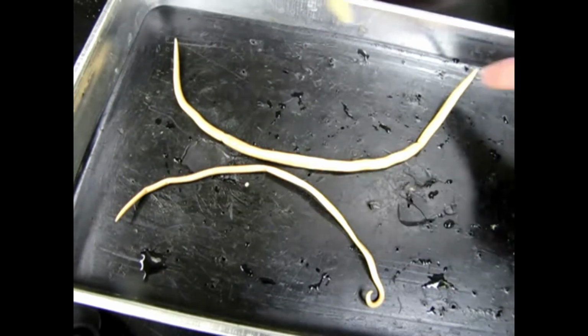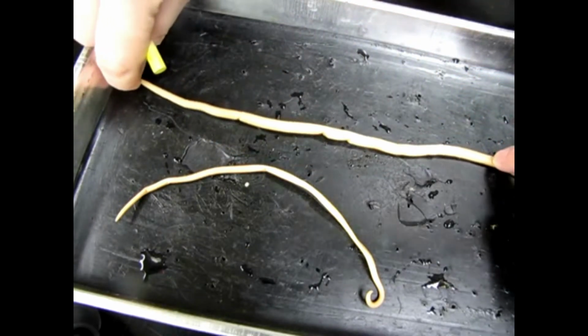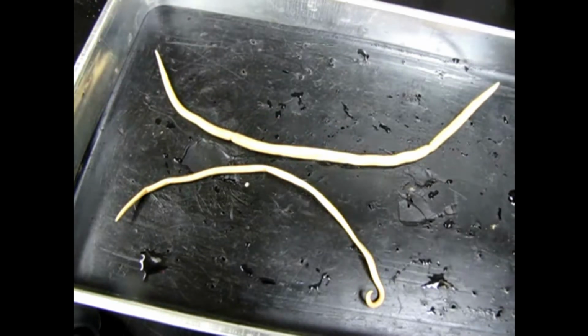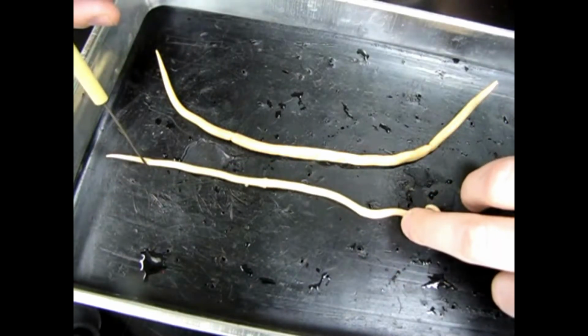So this longer, significantly longer and heavier bodied individual is the female. It's not uncommon in the animal kingdom to see females be larger, since they are the ones that are bearing eggs. And then this smaller fellow is the male.